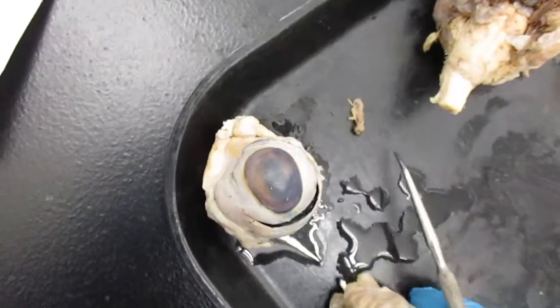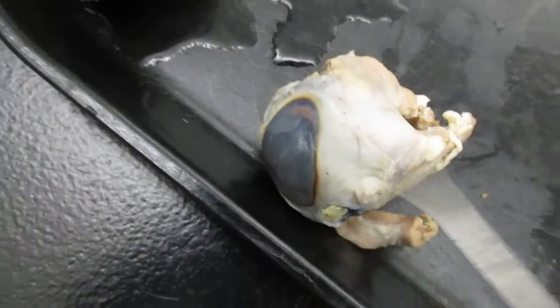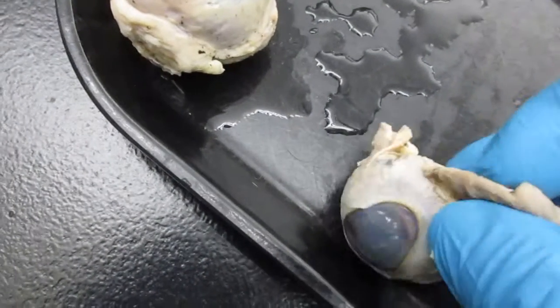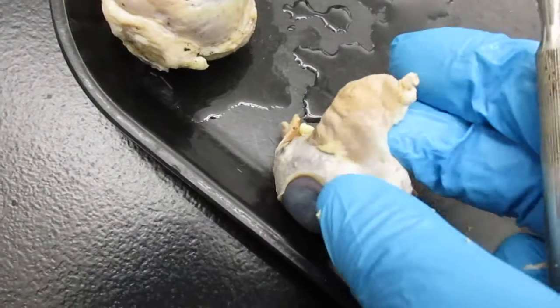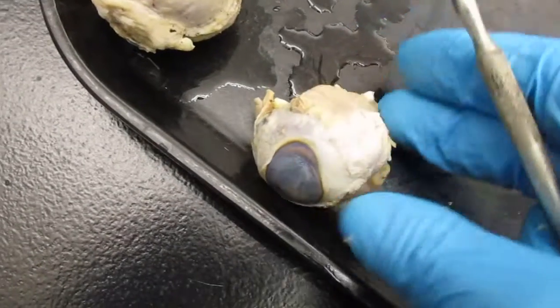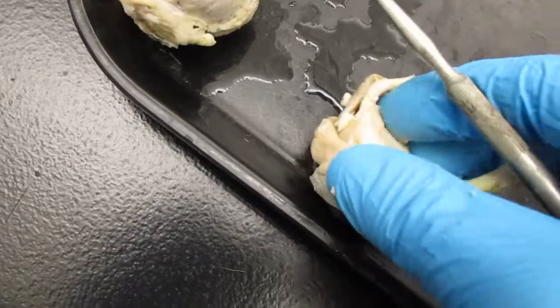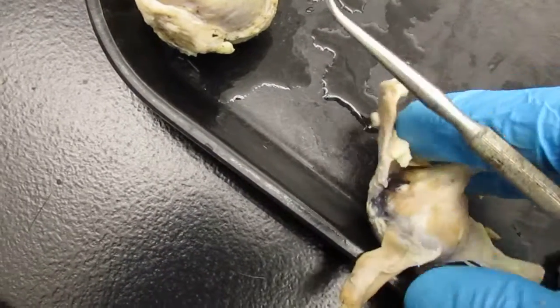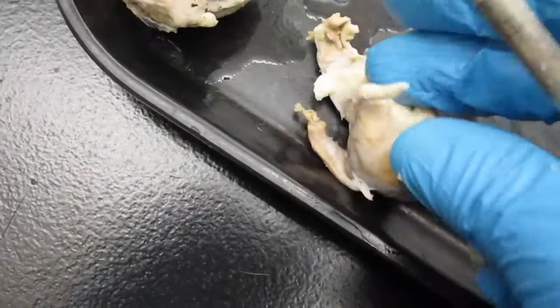And we can see right here, I've removed the fat and fascia and all that, and here I've saved this one to show you, I saved this eye for demonstration to show you an extrinsic eye muscle here. So I've removed the fat away. So extrinsic eye muscle here, here. Right here we see some extrinsic eye muscles as well. And then you can see the optic nerve right here.